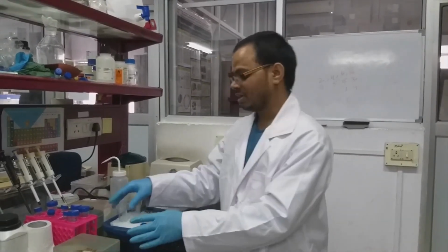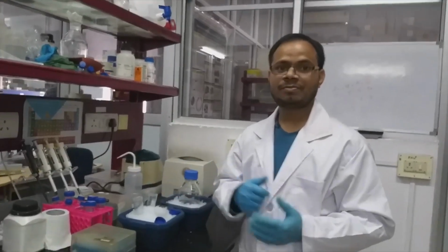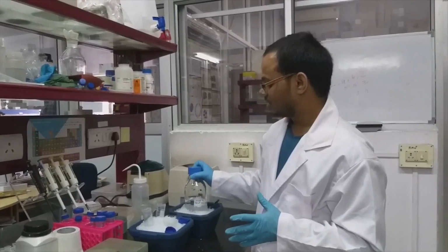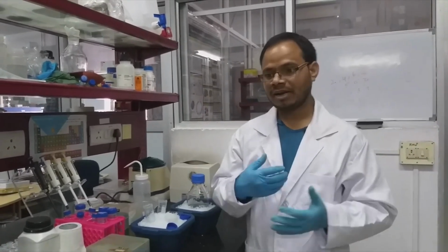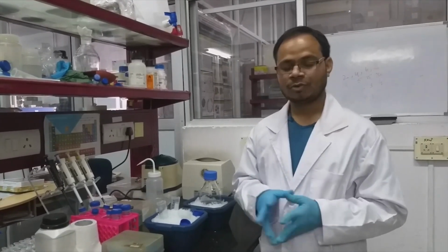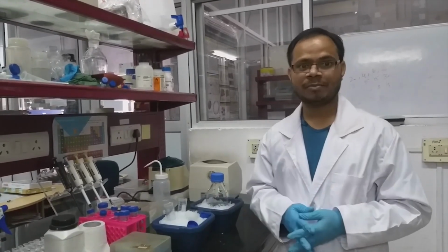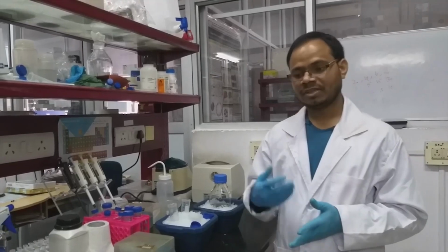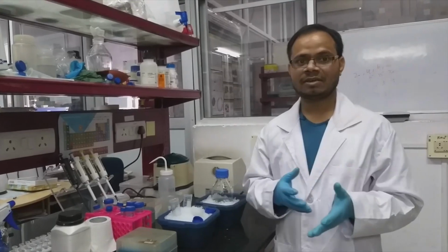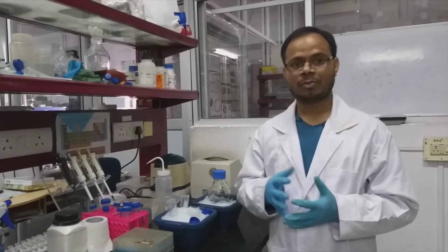So after centrifugation, we will get the pellet. For this pellet, we have to add lysis buffer of your choice. If you are lysing GST containing protein, you need special buffers, or if you are using maltose binding protein containing protein, you need a special buffer. So it depends on which insert you have and what protein it is conjugated to.